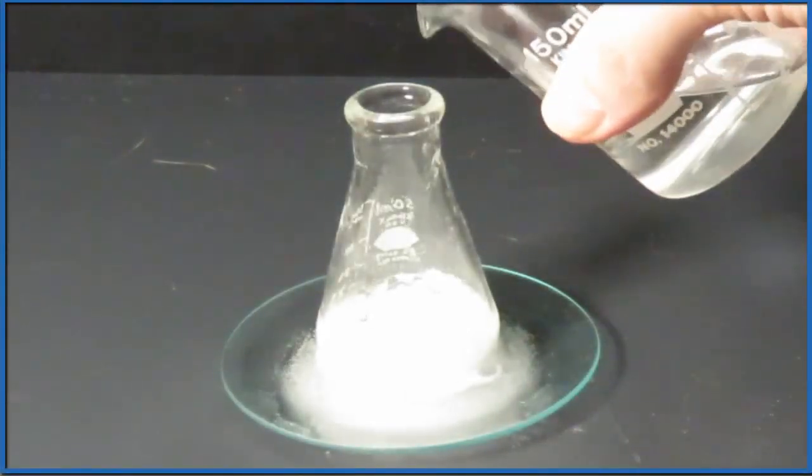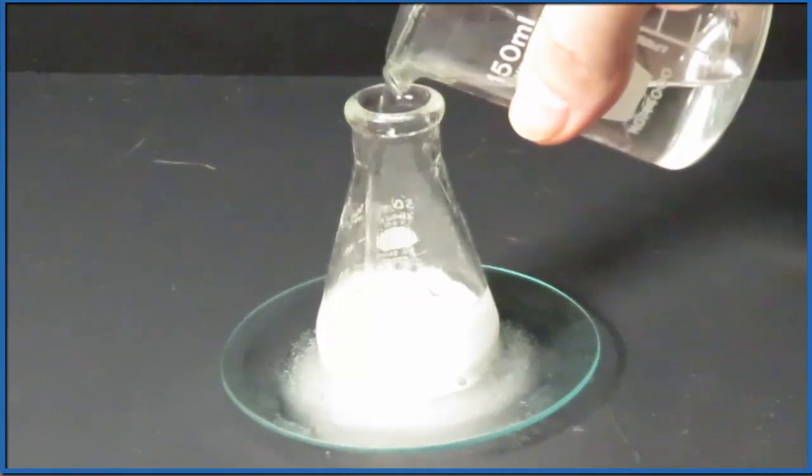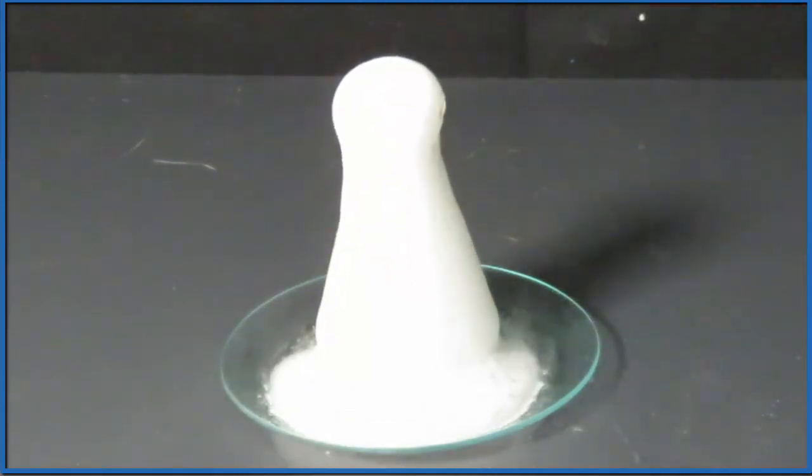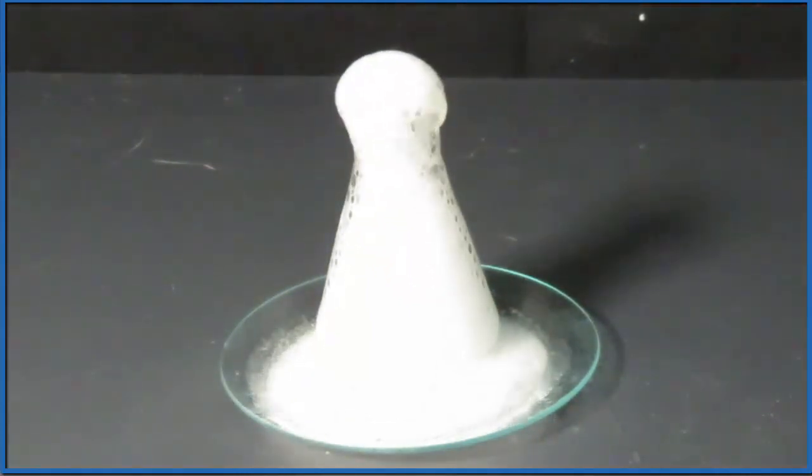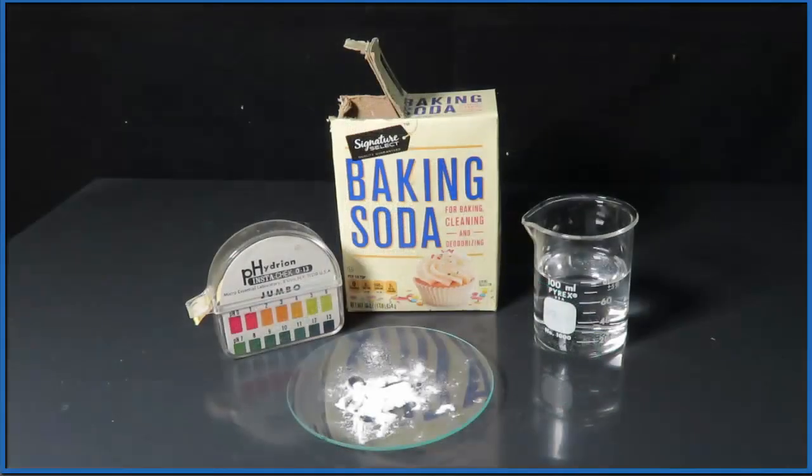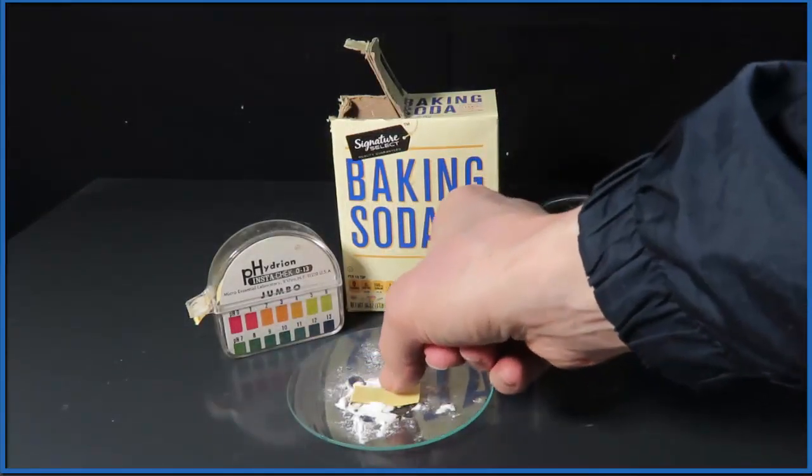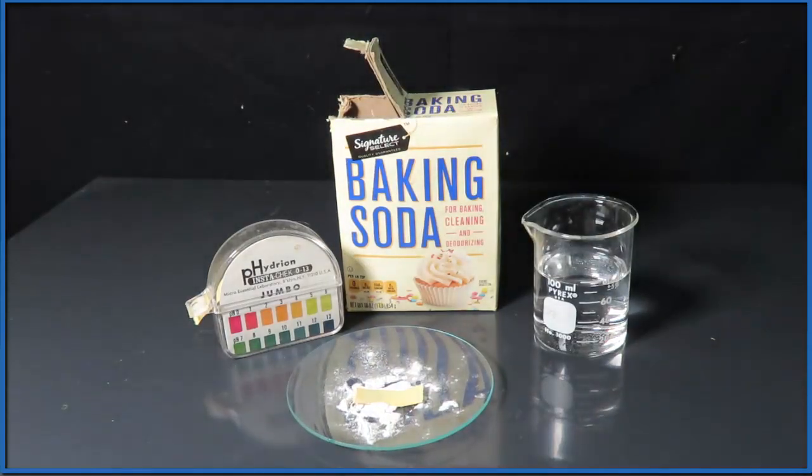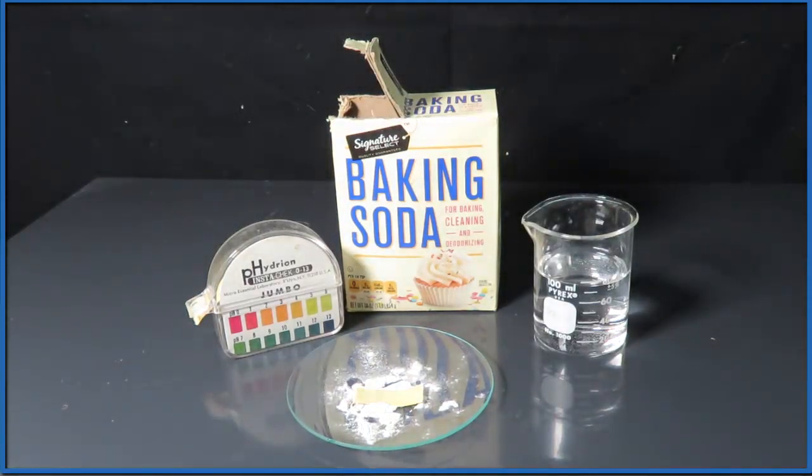In this video we'll take a look at the pH of baking soda. So most people are familiar, you take some baking soda, mix it with vinegar and you get that volcano effect of bubbles. So first we'll look at using pH paper to figure out the pH and then we'll use a pH meter.